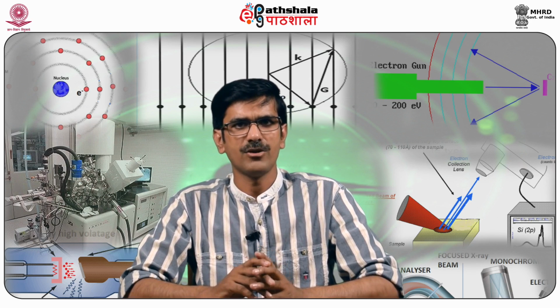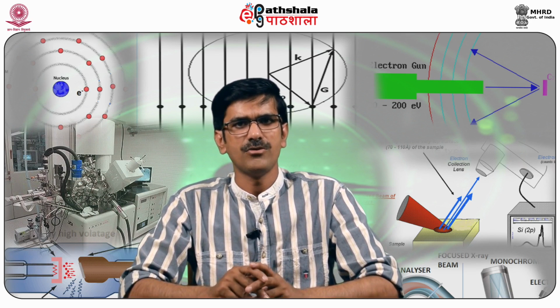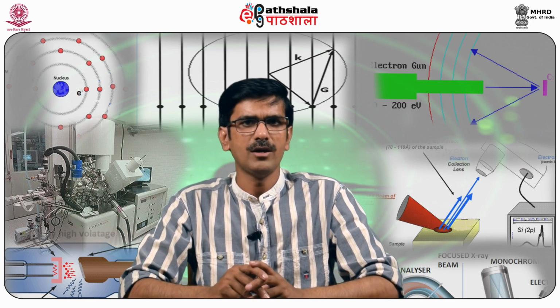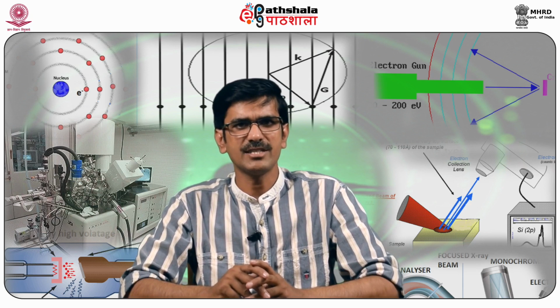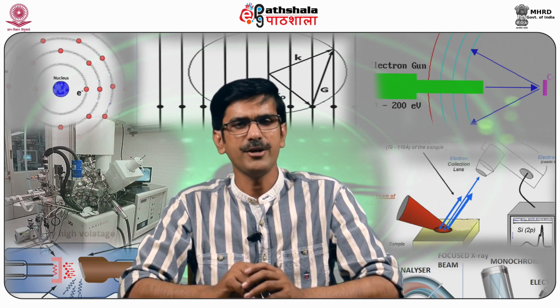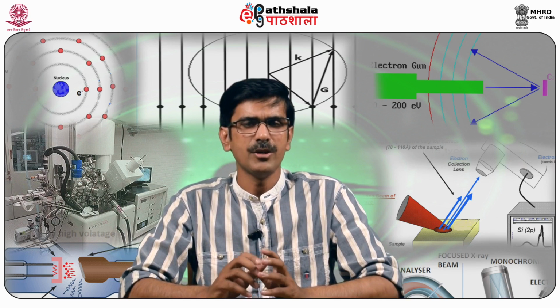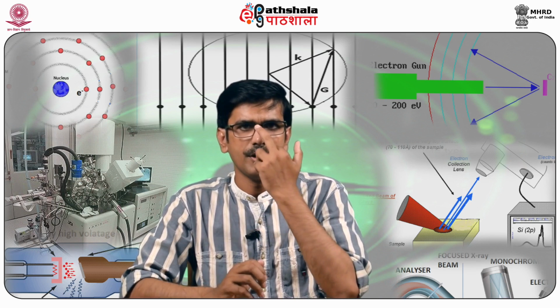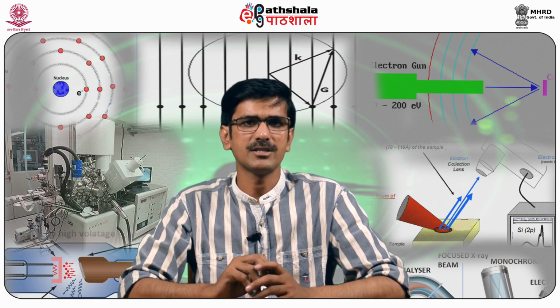Now, the next example is of biotite. Biotite is a phyllosilicate material of the mica group having the formula potassium, magnesium, iron, whole thrice, aluminum, Si3O10, OH whole twice. It is a sheet silicate in which iron, magnesium, aluminum, silicon, oxygen and hydrogen form sheets that are weakly bonded together with potassium ions. In biotite, strong peaks of magnesium, aluminum, silicon, potassium and iron are seen.